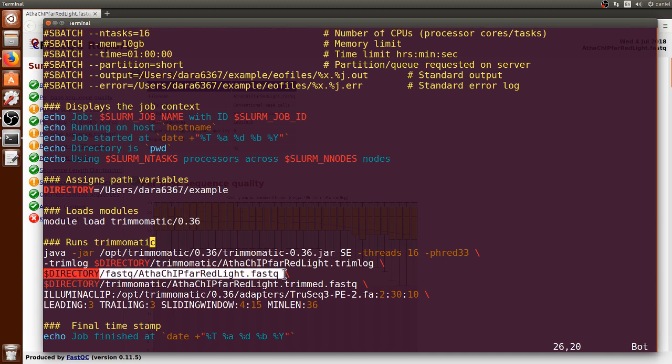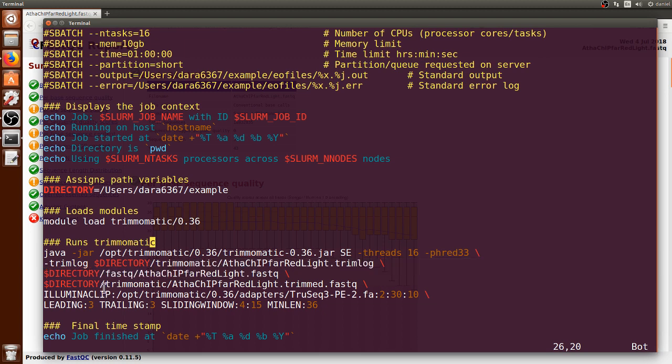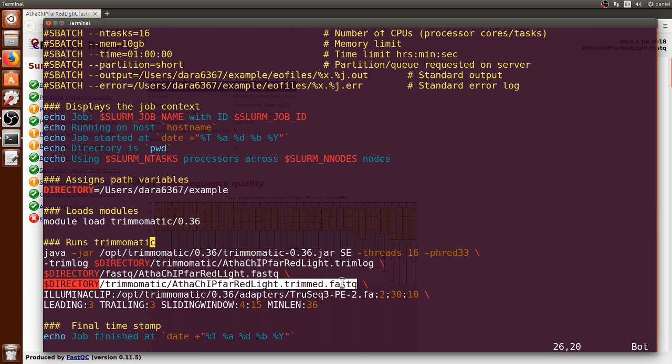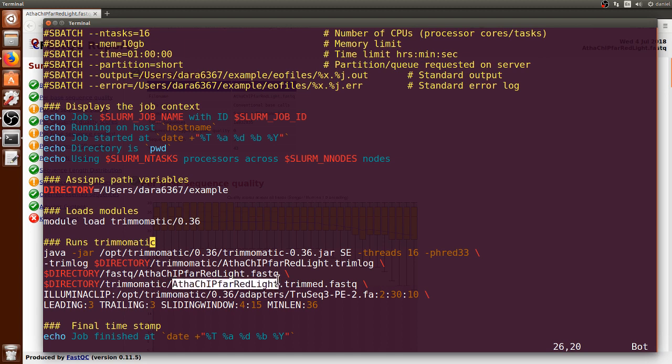Then we put the input file. In this case, it is on the FASTQ directory, and this has the FASTQ file of that Arabidopsis thaliana experiment. Then it is followed by the output directory, in which it will be saved on the Trimmomatic directory, giving it the same prefix of the FASTQ file, but I'm just adding dot Trim to differentiate it from the original file.